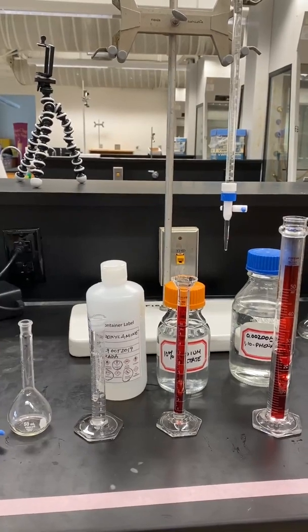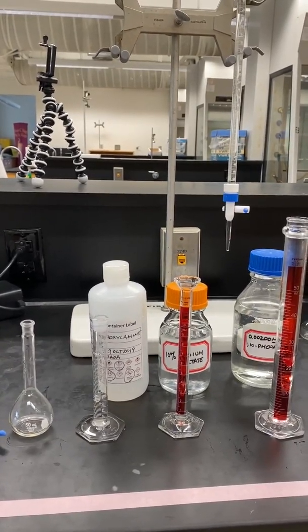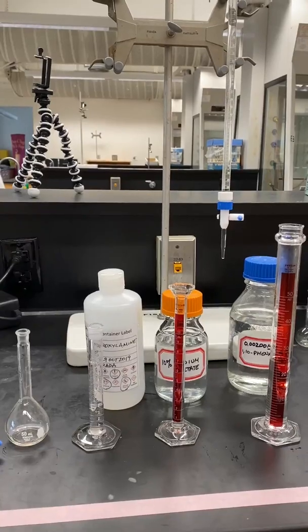Repeat this procedure for solution C using 4 milliliters of the stock iron, solution D using 6 milliliters of the stock iron, and solution E using 8 milliliters of the stock iron.